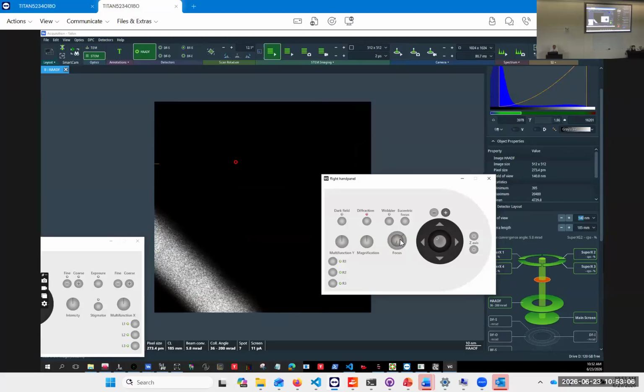Okay, here it comes. It's very slow. It's very far off. If you tilt, then you have a lot of. Should have done it with the C height, as I normally do that. We see the features in the top layer here.